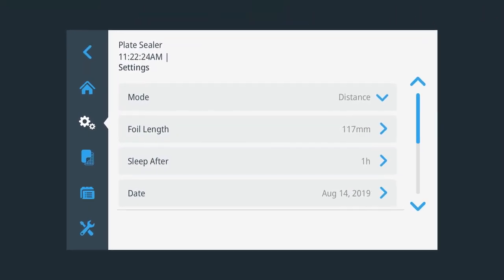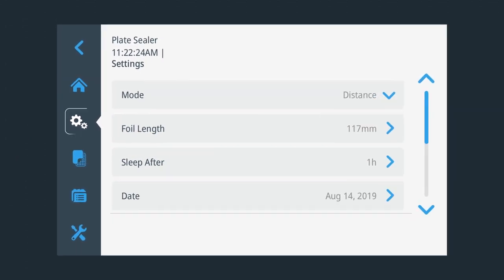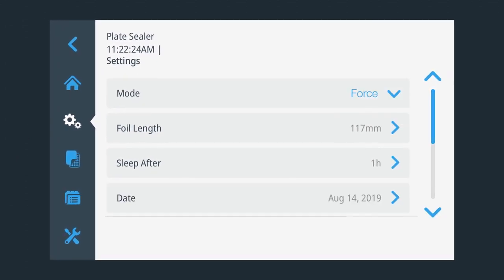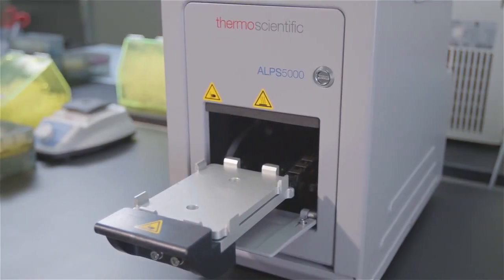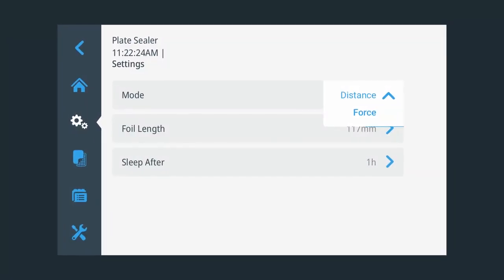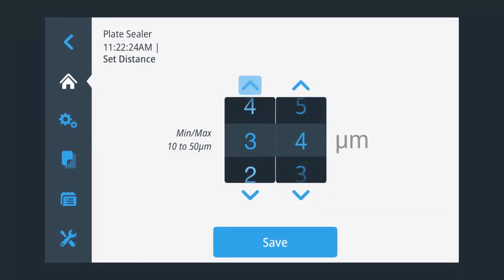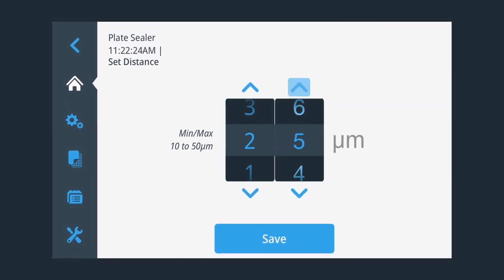With mode options, you can choose between force or distance sealing. When you choose the traditional force mode, the unit applies consistent force with the heating element against the plates and seal. Distance mode, on the other hand, allows the heating element to travel a preset distance rather than applying a preset pressure to the plate.